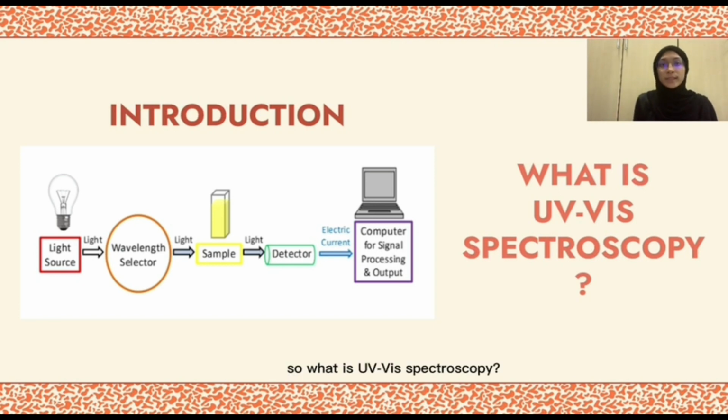So, what is UV-vis spectroscopy? UV-vis spectroscopy is called UV visible spectrum, or commonly known as UV-vis. It absorbs organic compounds such as benzene, inorganic species like transition metals, and charge transfer, which is a combination in which one species accepts electrons while the other one donates them.